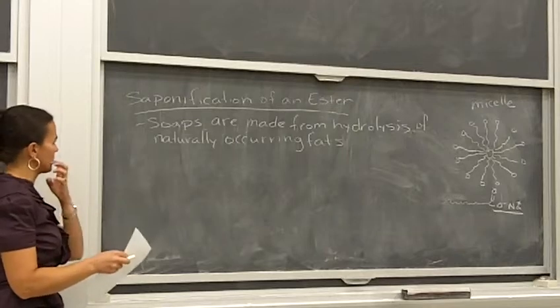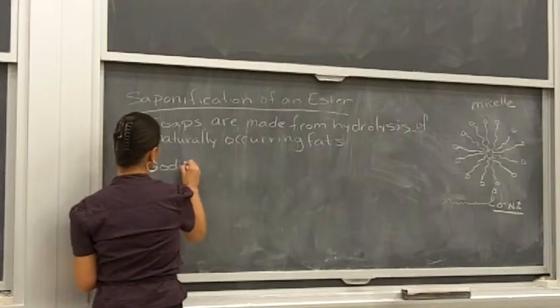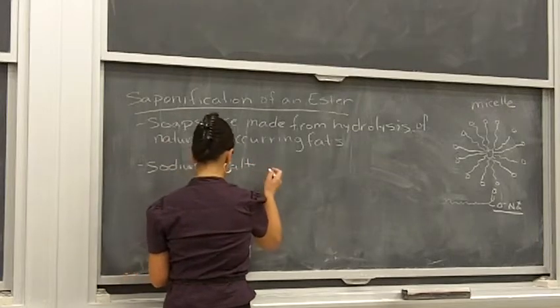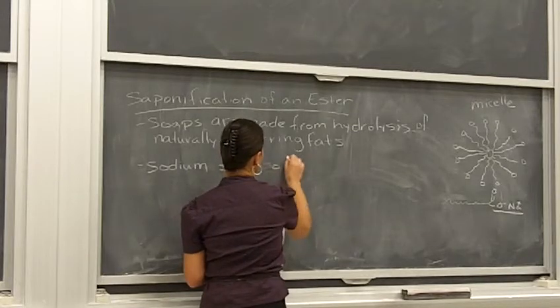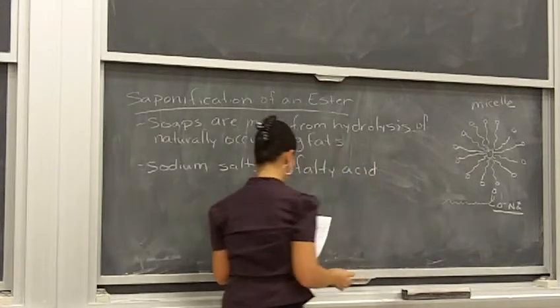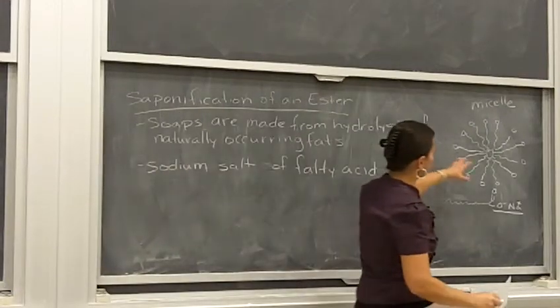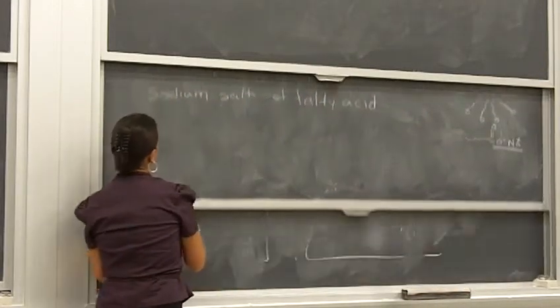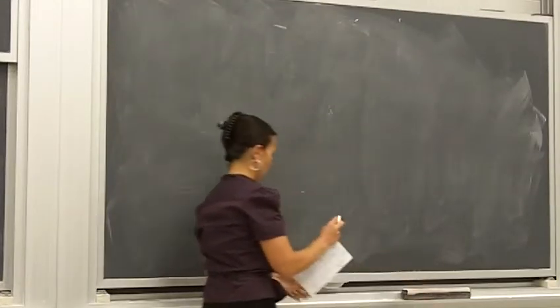So what we are going to do is a very similar reaction. We're also going to get the sodium salt of a fatty acid, and like I said, that saponification helps solubilize things that would not be soluble in water. So the reaction we're looking at, we looked at briefly last week, but I'll go through it again.